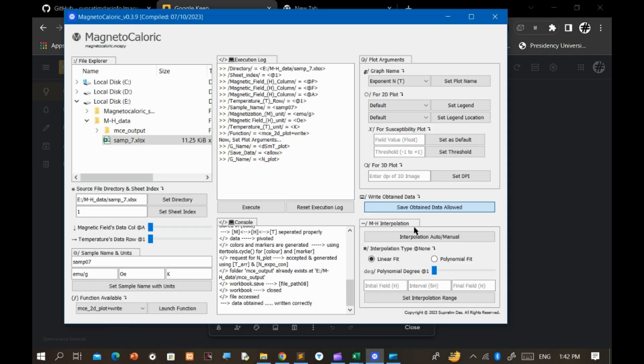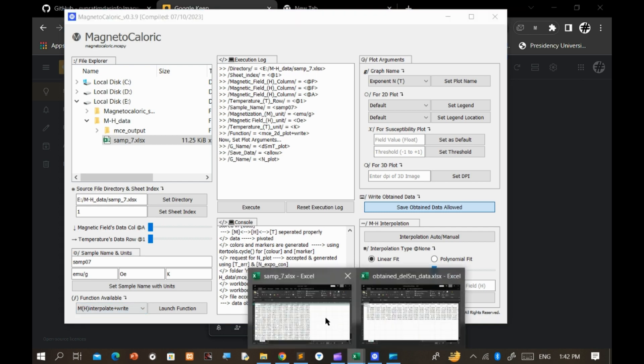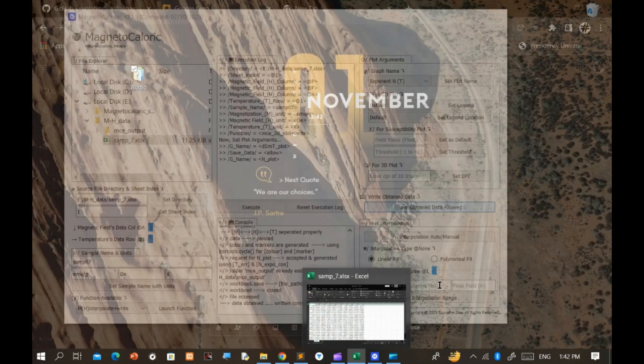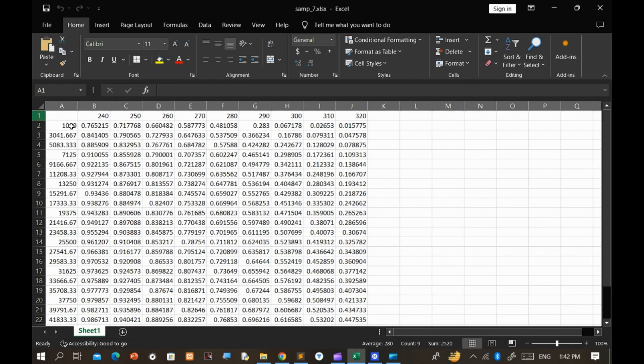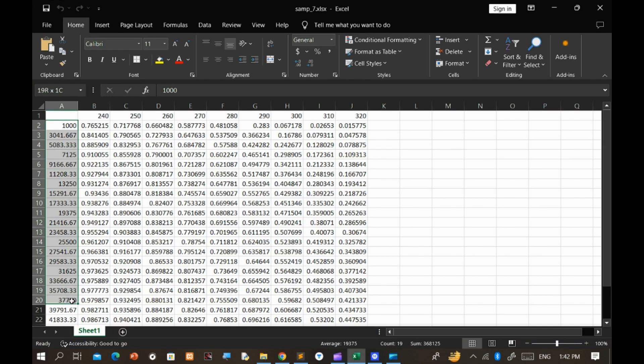Certainly, another significant function is the ability to interpolate the MH data. Let's walk through the process of performing this interpolation.